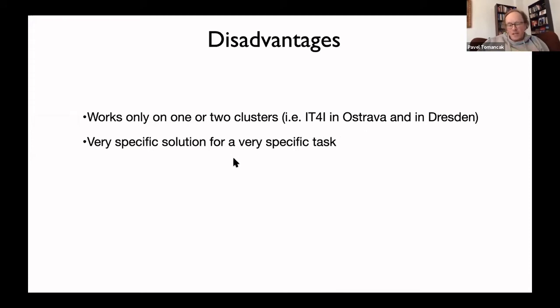And the other big disadvantage is that this is a very specific solution for a very specific task, right? I mean, this parallelizes the SPIM pipeline and it doesn't parallelize anything else, right? So in the rest of my talk, I will try to show you how we are on the way to developing solutions which address this kind of problem.